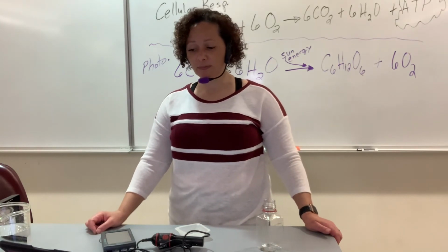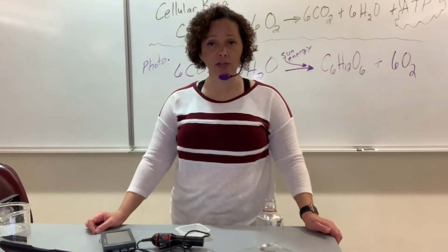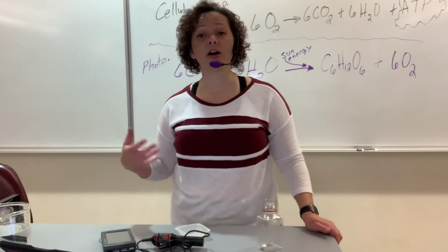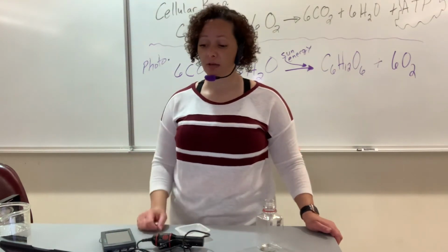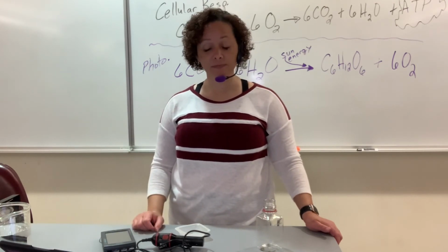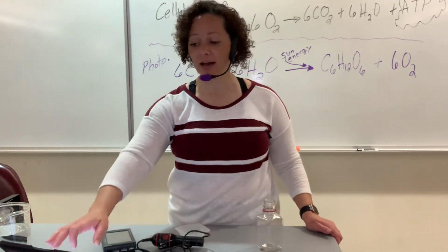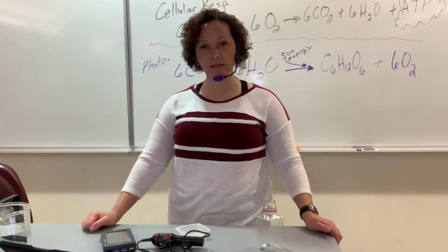And the average respiration rate is just literally the average slope, which is parts per million per second. Parts per million is the measurement of how much gas is coming out, the CO2. Per second is time. Divided by the mass of the organisms. Okay, so that is your purpose of this lab, to figure out the average respiration rate of these organisms.